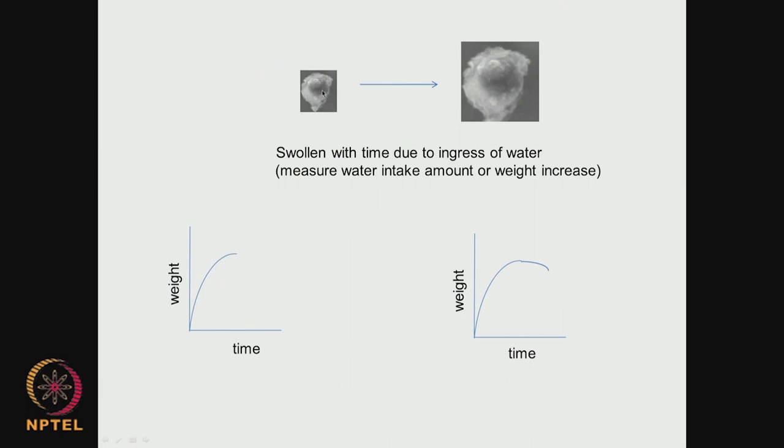For example, I may have a drug delivery system. I want to know how it gets swollen as a function of time because of ingress of water. As the water starts going inside, the polymeric material will start swelling. So there could be hydrolysis taking place.